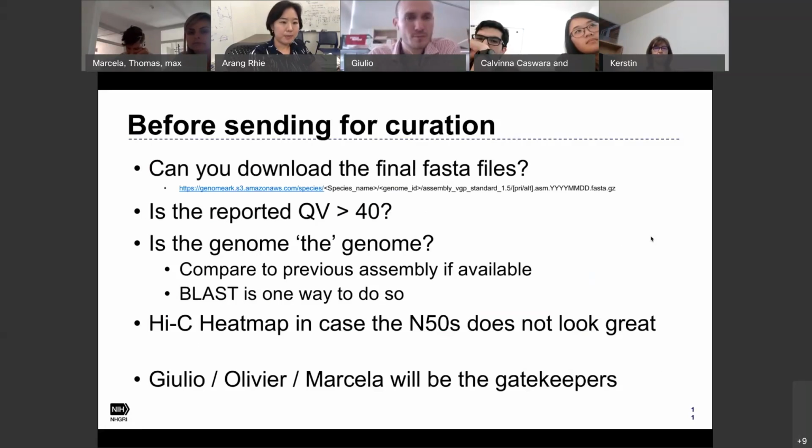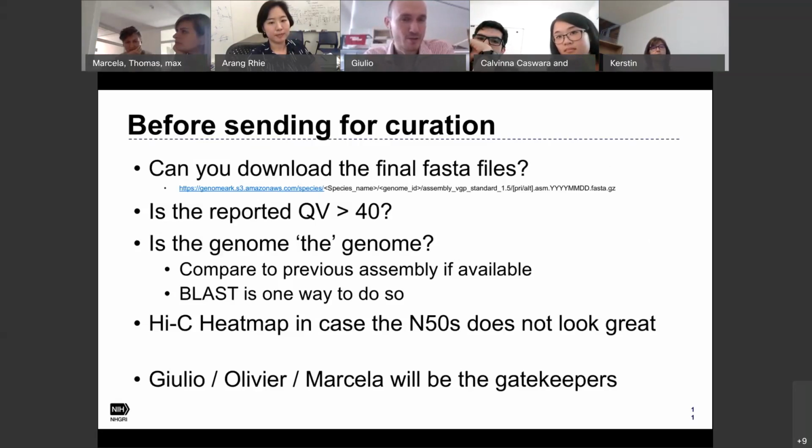So, do you have any questions up to now? If I may comment just one quick thing here. I would say that probably the QV calculated after the first round of polishing is more accurate in capturing any errors that may have occurred.